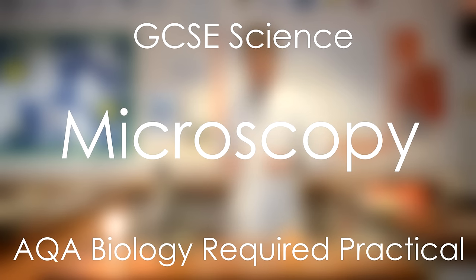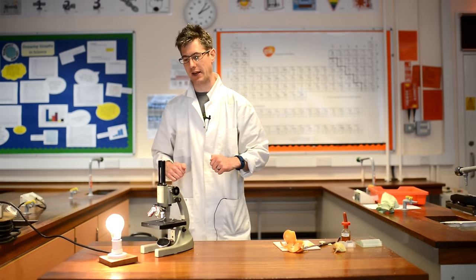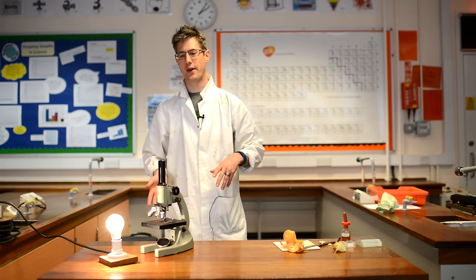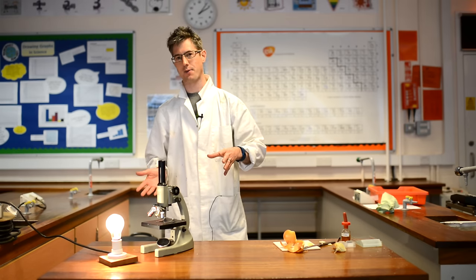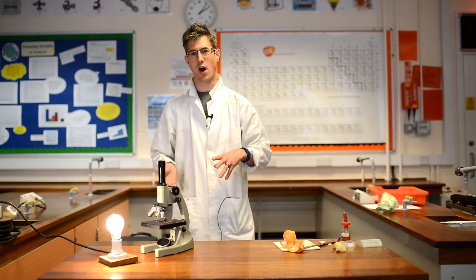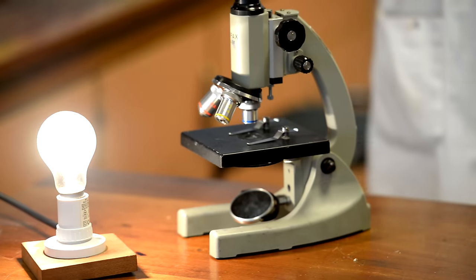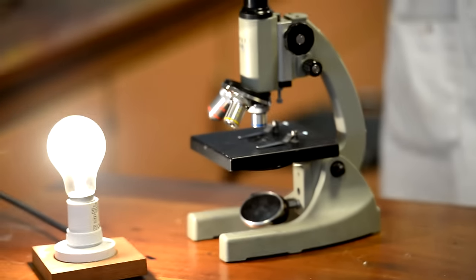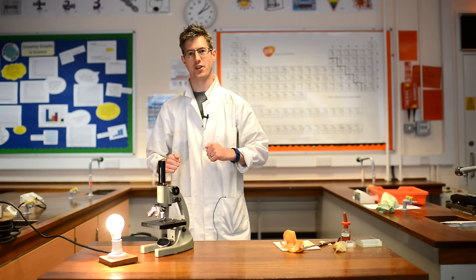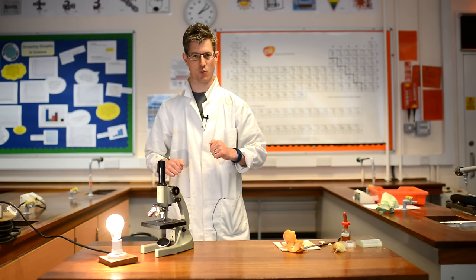Today we're going to look at one of the required practicals that involves the use of a microscope, a key tool in many biological experiments and a piece of equipment that is really important that you know how to use. We're going to look first at some of the parts of the microscope and how we use it. The required practical asks you to look at some onion skin as a plant tissue sample under the microscope, and we're also going to try and estimate the size of some of the onion cells.